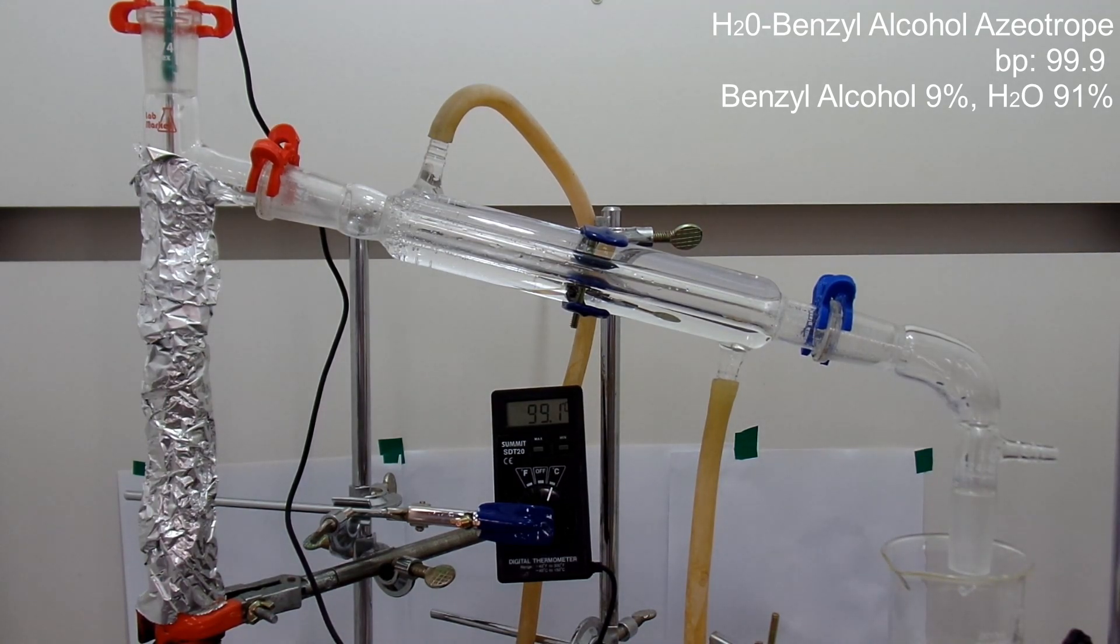Benzyl alcohol would be about 10 milliliters maximum, but we have excess water. So all we got after the fractional distillation was water-benzyl alcohol azeotrope that contains a little bit of benzyl alcohol.